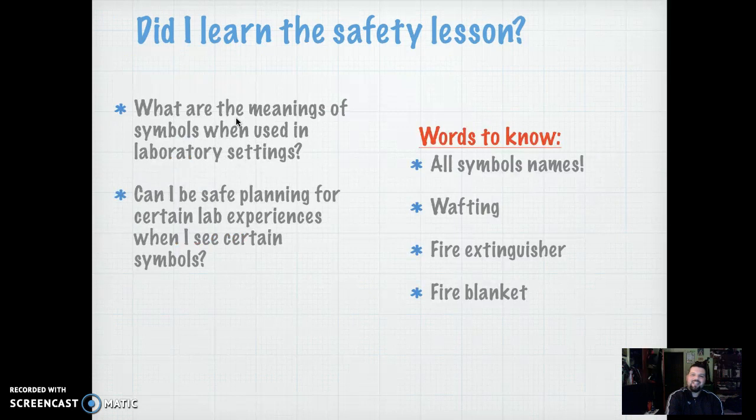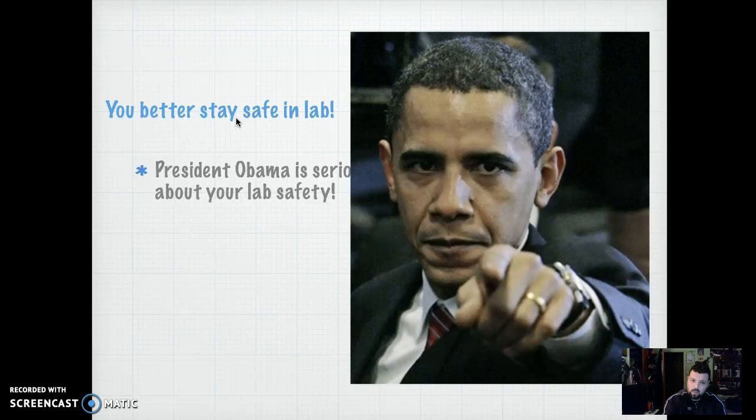So these are the symbols I want you to know. Please draw them and write them down, and we'll talk about them more in class and about your project as well. Like President Obama says, he's very serious about your lab safety, and so am I. So kids, thank you — I will see you on the flip side.